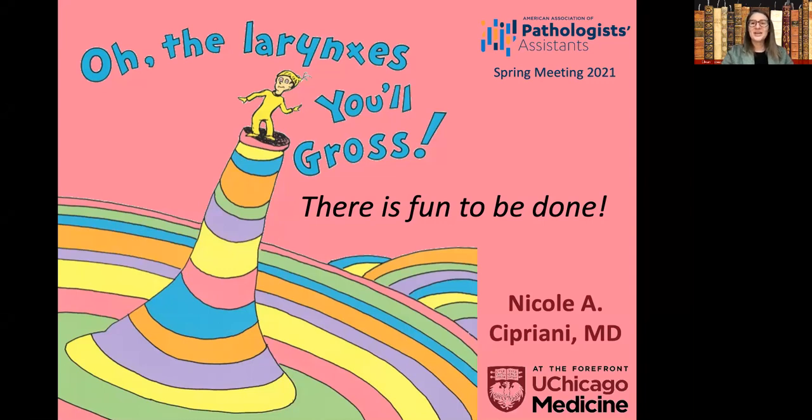So today we're going to be talking about larynxes. Oh, the larynxes you'll gross. There is fun to be done. I love laryngectomy specimens. I think in all of pathology, and especially in head and neck, they are some of the most interesting, complex, and beautiful specimens that we can encounter. So I hope you agree with me, and I hope you learn something from this lecture.